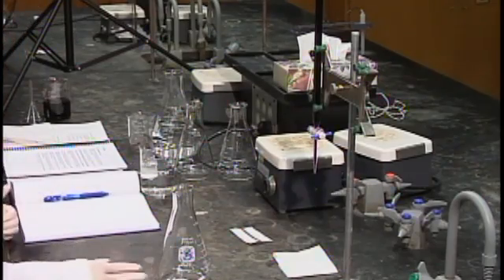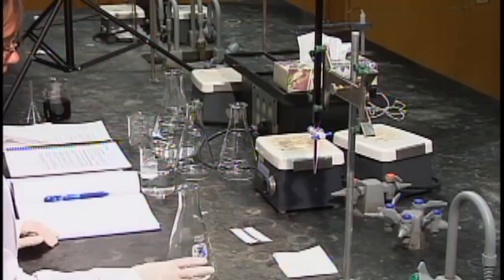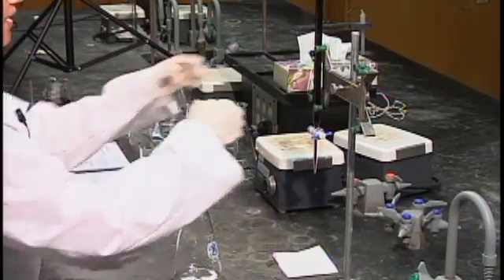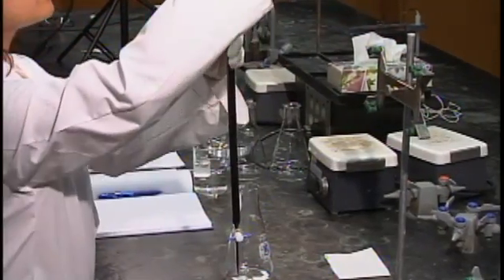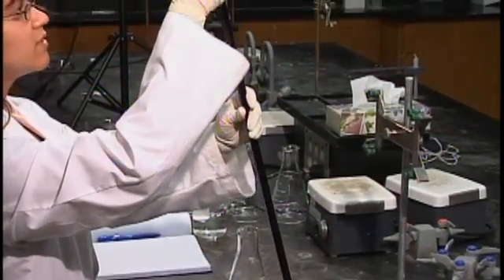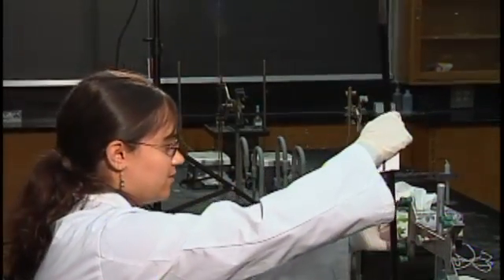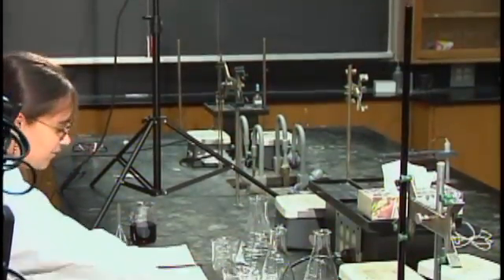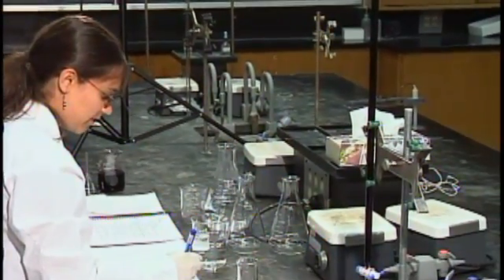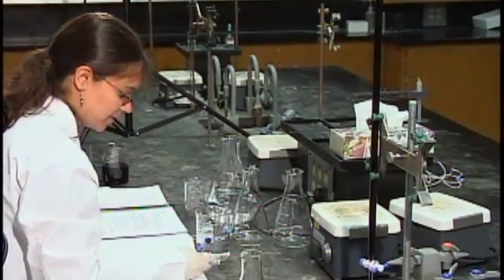So we're going to start with step 5, assuming that steps 1 to 4 have been done already. So we first have to check our initial reading of our KMnO4. So in my case, I have an initial reading of 3.2 mL.